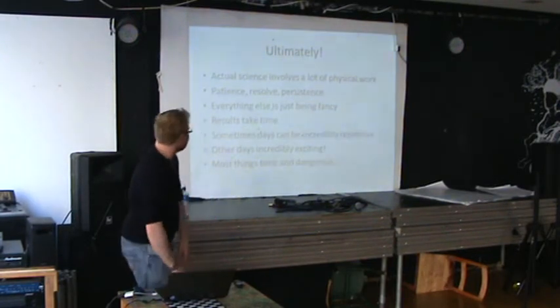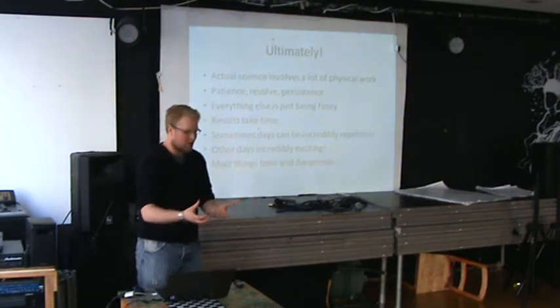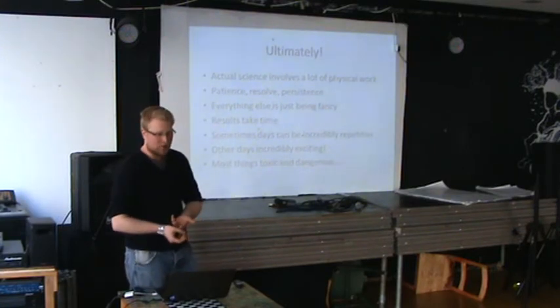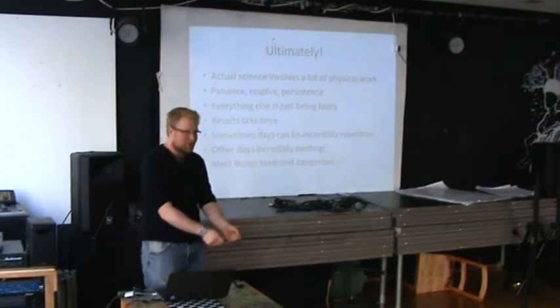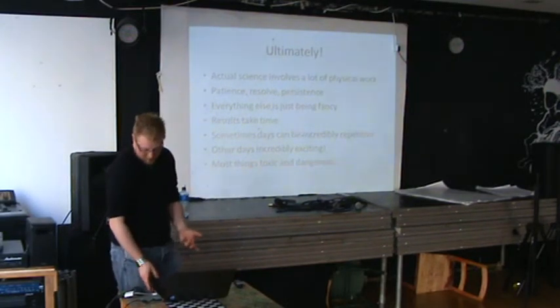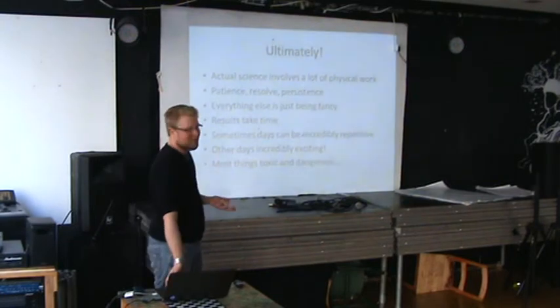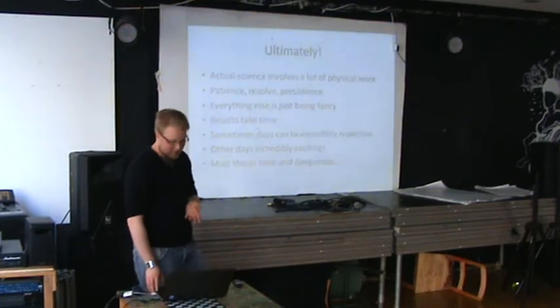So ultimately, what I wanted to say was that actual science is a lot of physical work. The videos I've shown you showed a lot of putting glass plates together, pouring gels, and putting sandwiches together. There's actually very little brain work during the day on some levels. It's literally taking sponges, wetting them, putting filter paper on top, putting a gel on it. It's a lot of actual physical, somewhat boring work. It's just a lot of patience, resolve, and persistence. Everything else is just being fancy, and the results take a really long time. Some days can be really repetitive, and other days incredibly exciting when you get really good results.